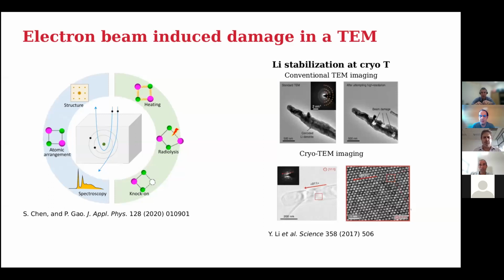I see. Okay, and my last question is quite general. On the last part of your talk, when you talked about ferromagnetism and this kind of thing, I was wondering, it would be very cool to have a device where you can also control the spin of the electrons, right? To have, I don't know, some spin-polarized electrons, and then some kind of spin imaging. Are we very far from this kind of technology right now?